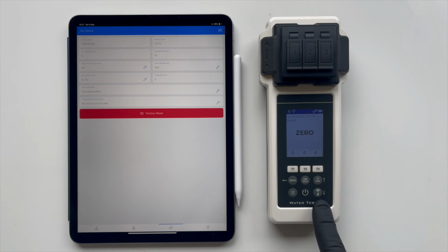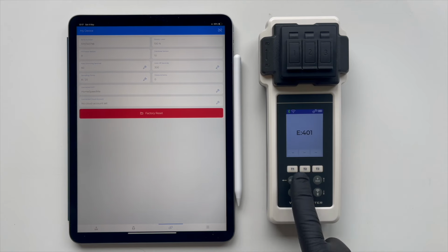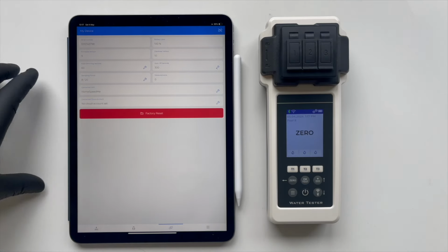The tester attempts to connect to Wi-Fi by initiating a network search to locate and establish a connection with the available wireless network. This connectivity is essential for leveraging cloud storage capabilities and accessing remote functionalities that enhance the device's usage. If you see error 401 on the screen, it indicates that the Wi-Fi login or password has been entered incorrectly. Press the 0 button to go back.